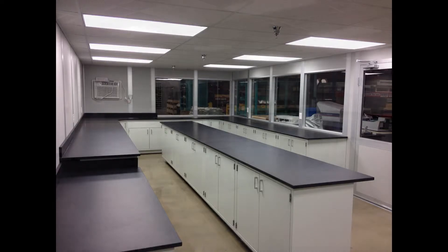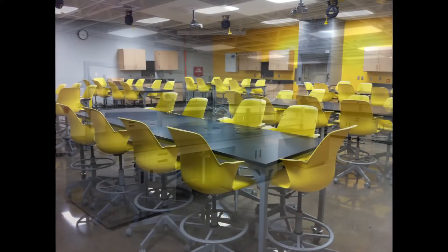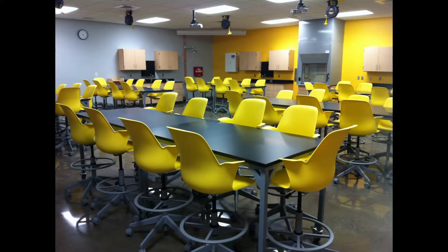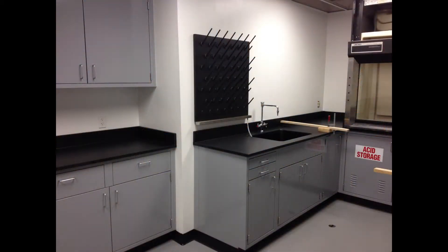Our epoxy countertops give a laboratory-grade performance. They're resistant to many chemicals, moisture resistant, extremely durable and easy to clean. NSF approved for food services. They're non-porous and never require sealing.